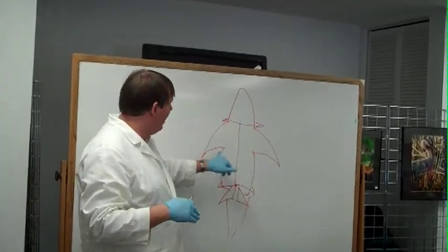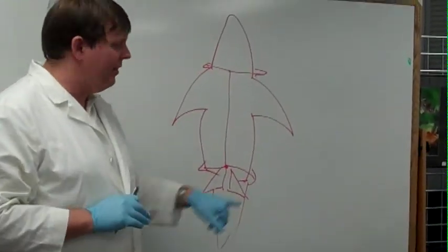This is the head, by the way. The pectoral fins, the pelvic fins are down here. This is the body.